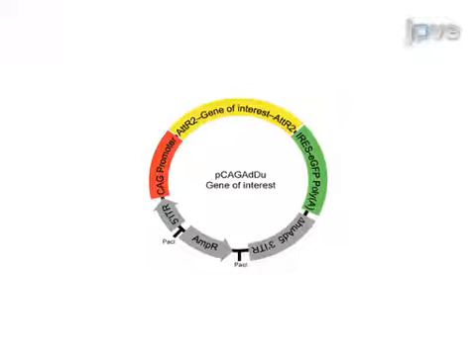Next, 10 micrograms of the adenoviral expression vector is linearized in a PacI restriction digest. The DNA is then precipitated and resuspended in water at a concentration of 3 micrograms per 100 microliters. Linearization liberates the viral inverted terminal repeats, or ITRs, which are required for replication and encapsulation of the viral DNA into virus particles.